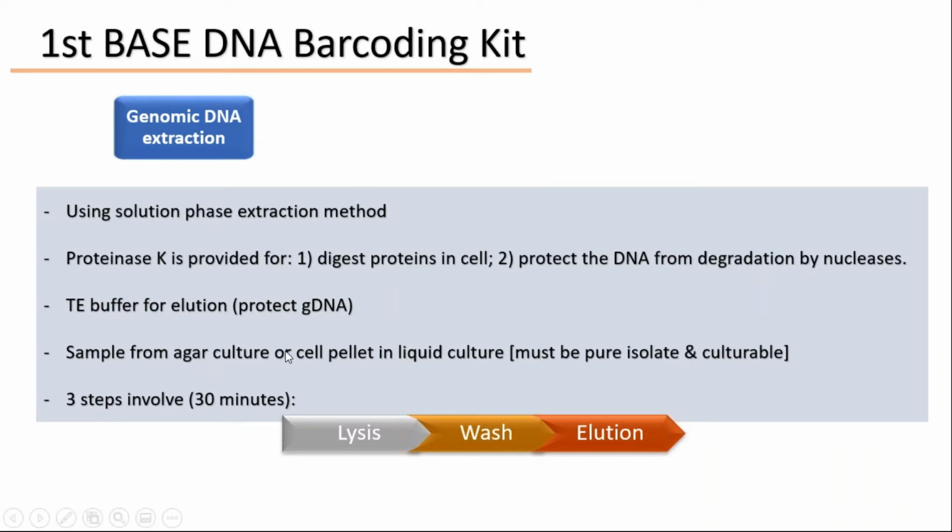Okay, this part actually is just a very simple step. It involves lysis step, washing step, and elution step only. So the total time that we need to spend is around 30 minutes only.